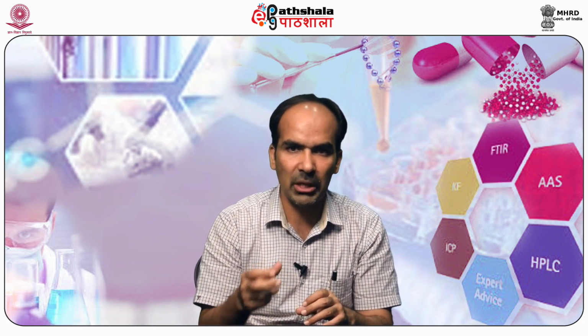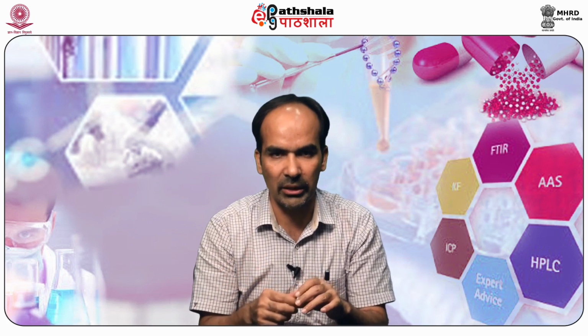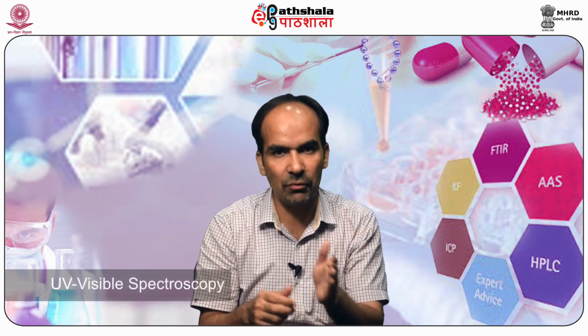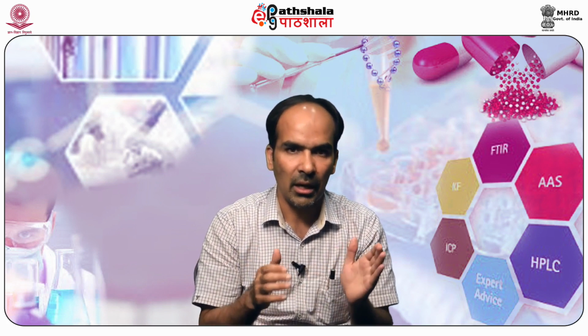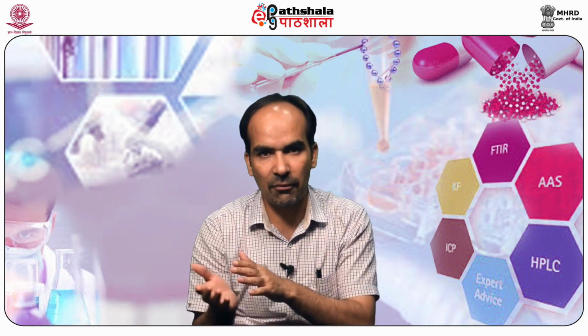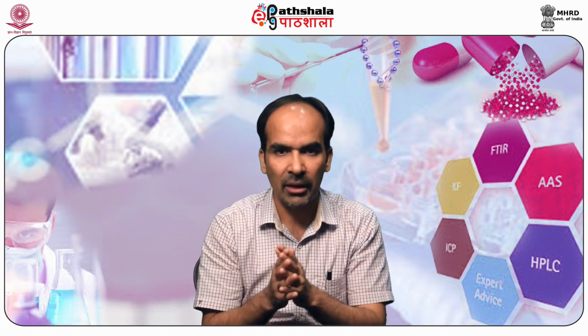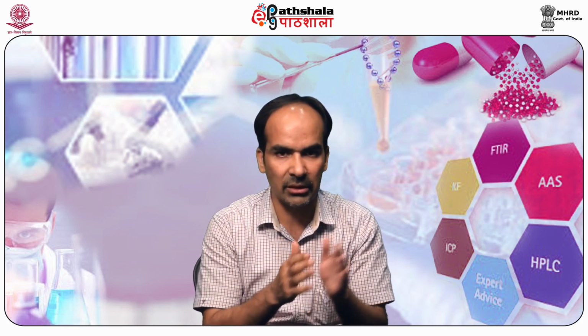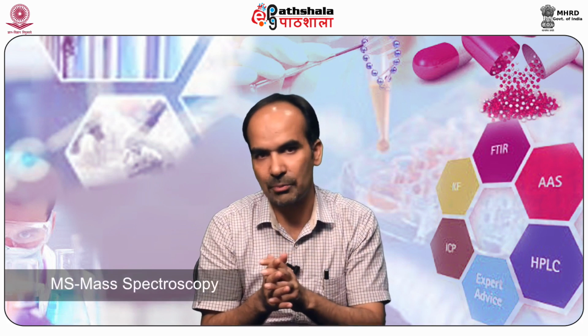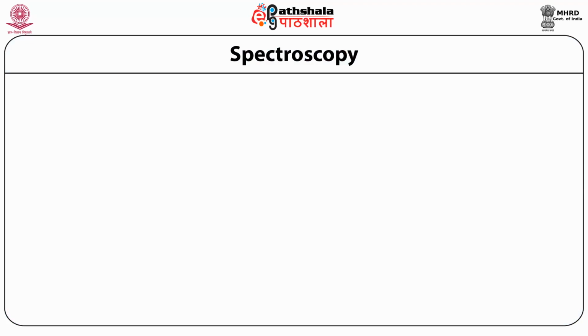Spectrophotometric or spectroscopic evaluation can be based on any of the following. It can be based on UV visible spectroscopy, IR spectroscopy, fluorescence spectroscopy, X-ray diffraction, or even nuclear magnetic resonance spectroscopy, and last but not the least, mass spectroscopy, which is known as tandem mass spectroscopy. So now let's understand what spectroscopy is.